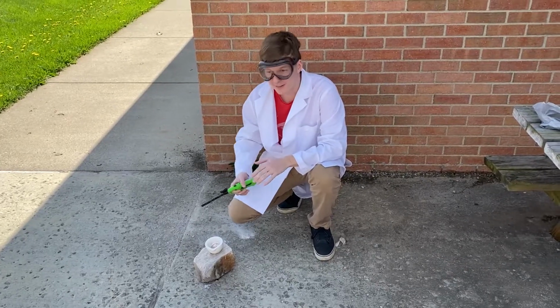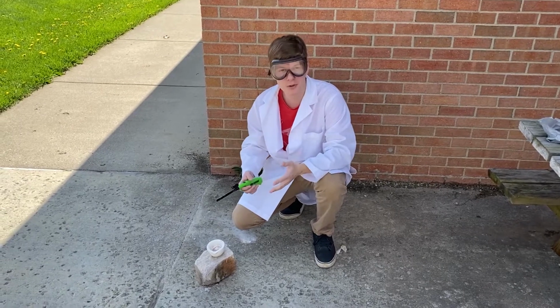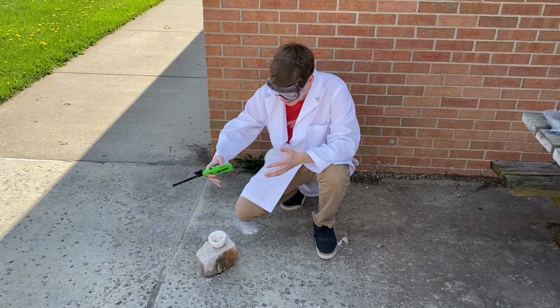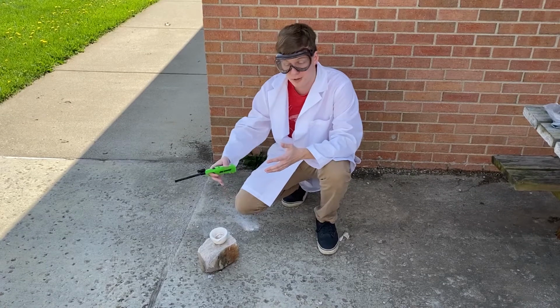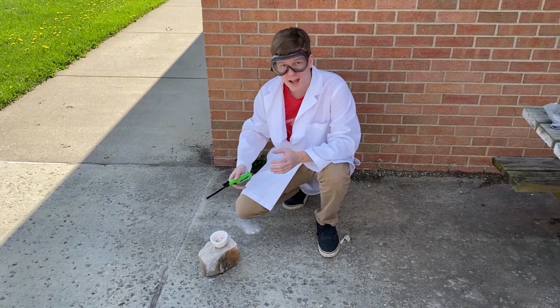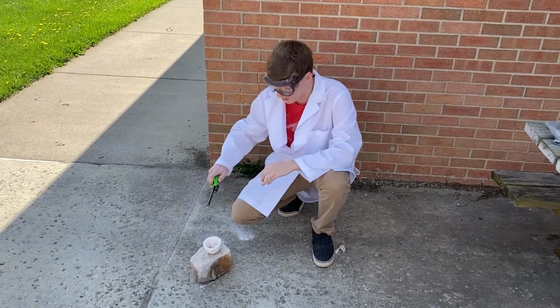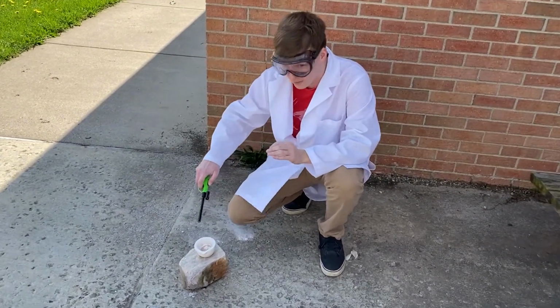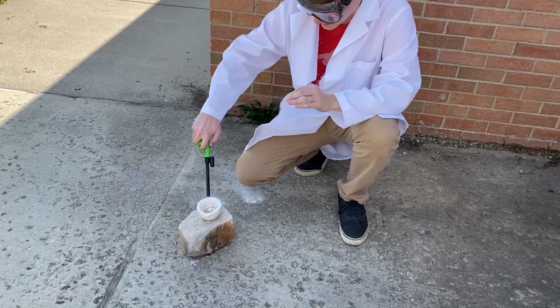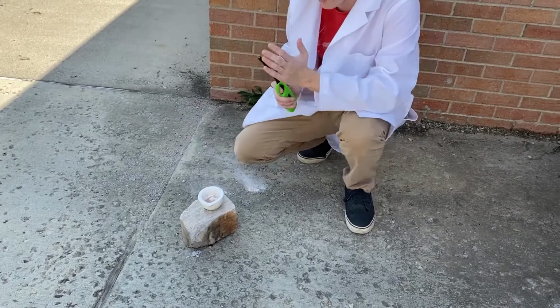Now, I hope you guys didn't think that we were just going to do that once and call it quits. No, why do that? We made extra, might as well use the extra. So remember, this is our potassium chlorate and our sugar. I got a little bit of extra here, and this time I want you to pay very close attention to the color of the flame that is going to be produced. Pay attention to what color flame you see here, and we'll just light this up. A little windy.